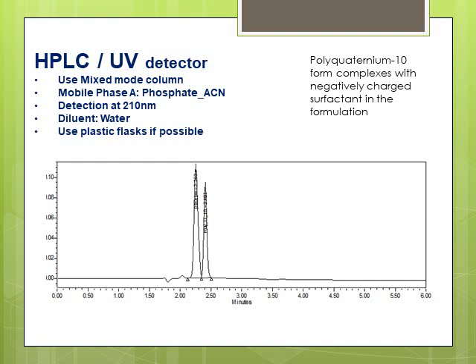So with the two methods that I showed you, you would be able to do the quantitation, meaning that you can do the amount determination, how much is in there. But in both chromatograms, there was no profile that you could use to make a grade determination or pinpoint who was the manufacturer of this raw material. There was no other information than a single peak.